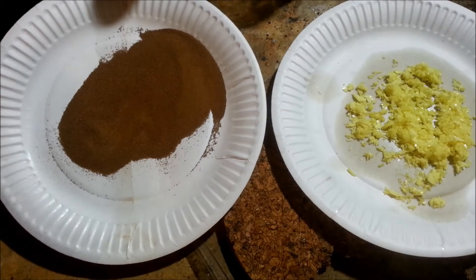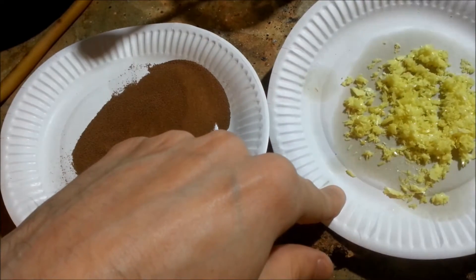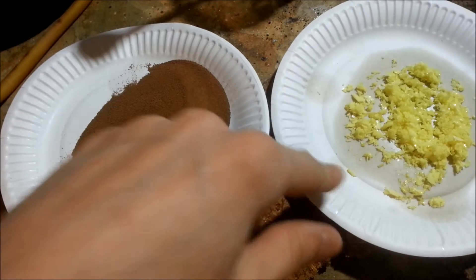Hi YouTube, today we'll be making sulfur crystals from garden grade sulfur. The sulfur is however quite contaminated and will first need to filter off the impurities.